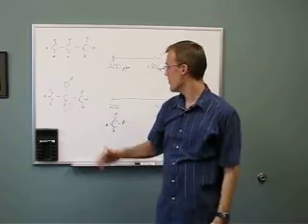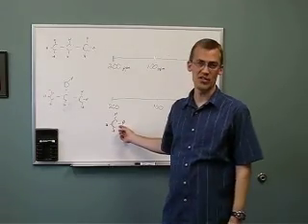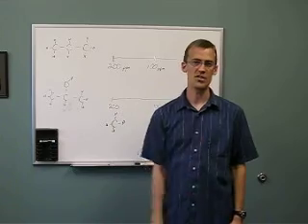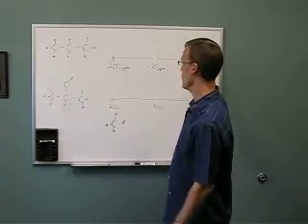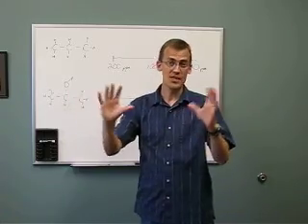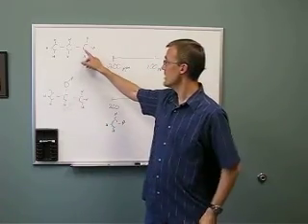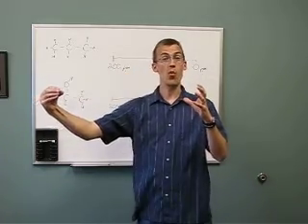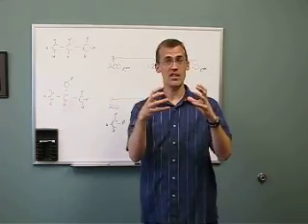So we basically pick a molecule, something very simple, and we say, okay, this is the normal resonant frequency for carbon, and we'll call that 0. Then, as the molecules become more interesting, we're going to see that things you attach actually pull electron density away from that nucleus, away from around that nucleus.